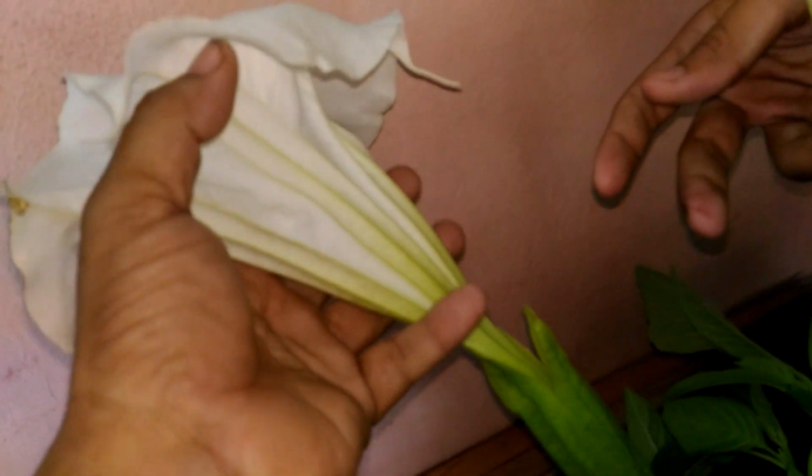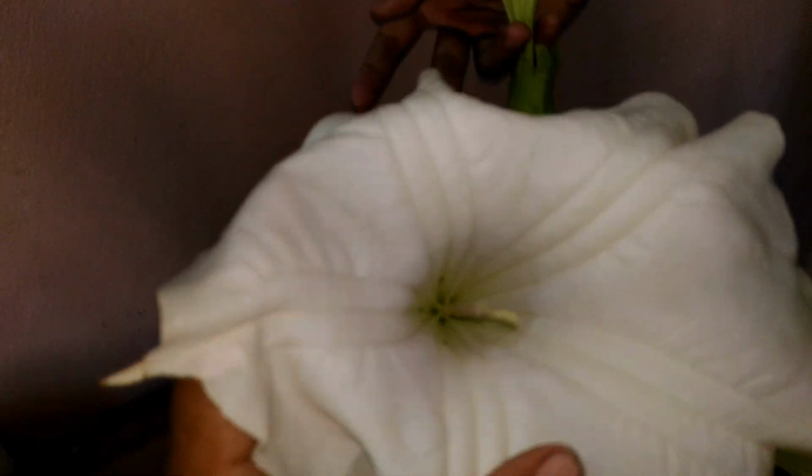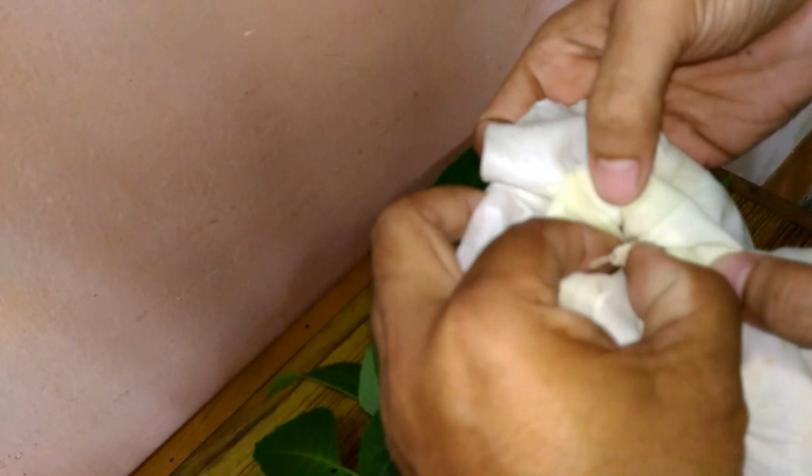The calyx tube is long, tubular, 5-toothed. Here I am showing that tooth of the calyx tube. 1, 2 and 3, 4, last one is 5. Corolla is funnel shaped, 5-lobed, lobes with acuminate tips, and it is white in color. Stamens are 5 in number, which are adnate near the base of the corolla tube.